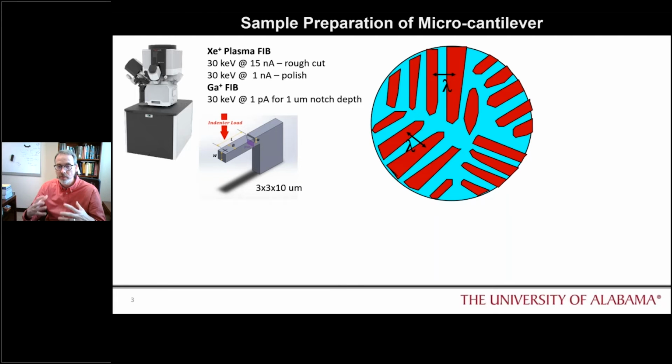But what you can see is we're pulling it. We see some notch widening, some cracking, etc. This is kind of a nice live video. And this is, again, one of the advantages of doing things in situ: you can correlate the quantitative load and displacement values to actual images that occur in the deformation of the material itself. And so in these snapshots, I'm just generally showing you some of the features that we observe. Well, obviously T1 is really at the initiation of our experiment where we've made our FIB-based notch.